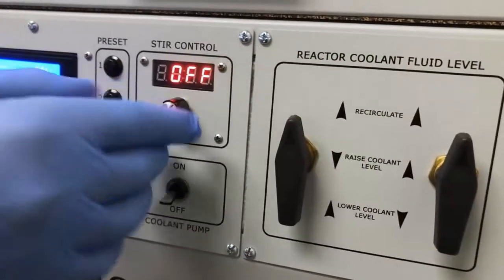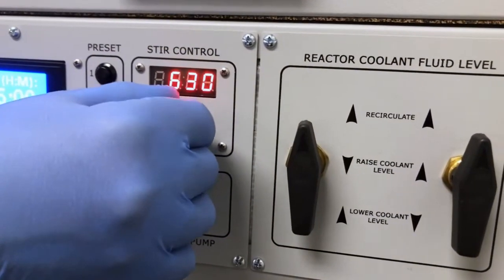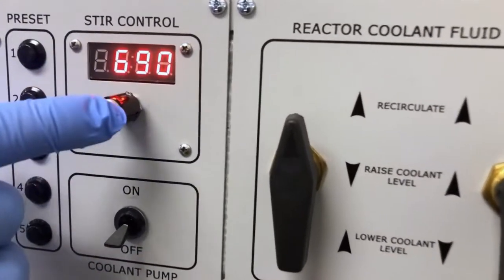The stir control allows you to set the speed of the heavy-duty stirring magnets under the reaction chamber. Simply press the control knob, turn it on or off.